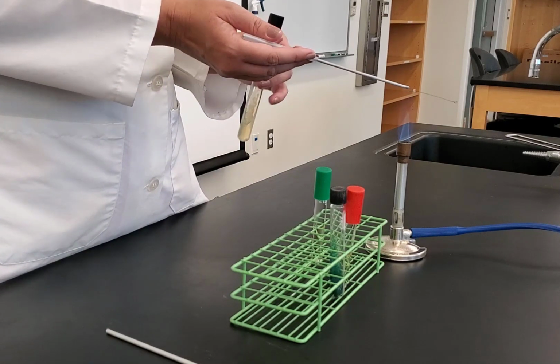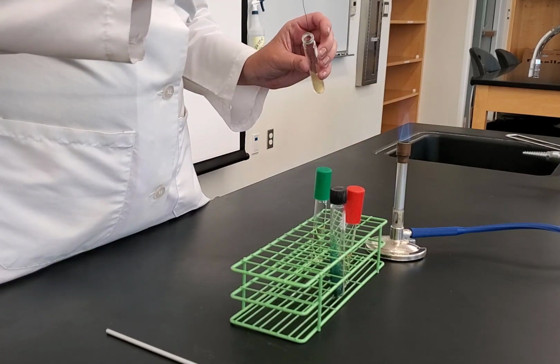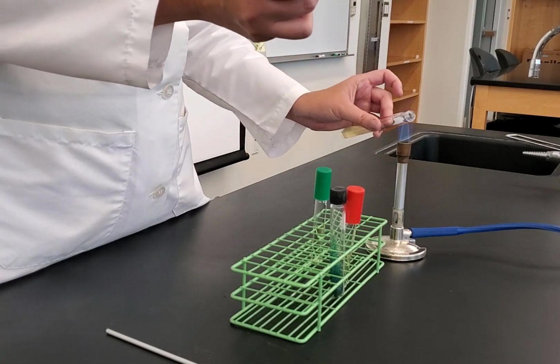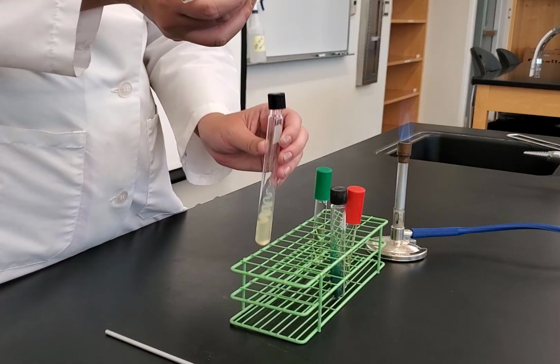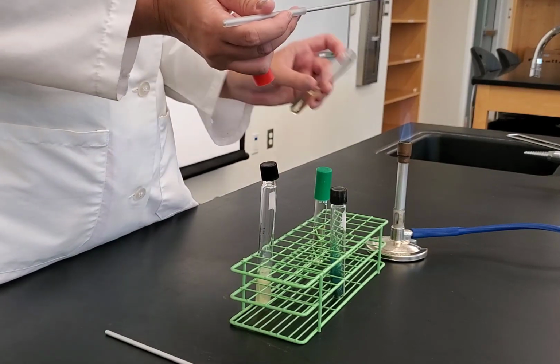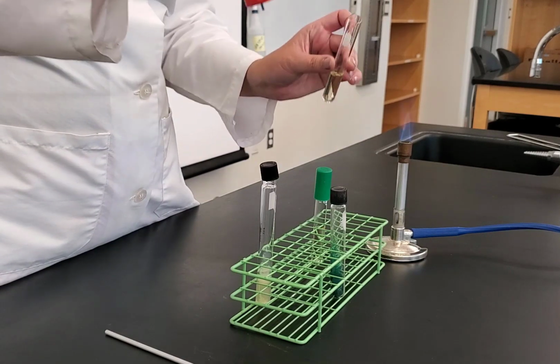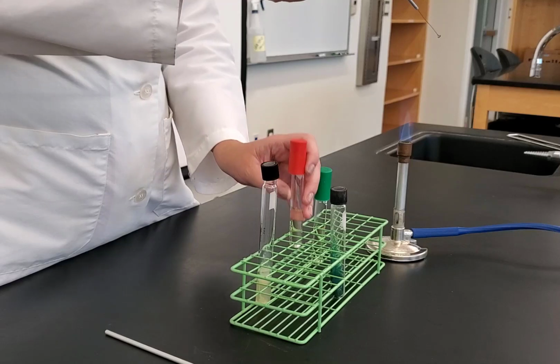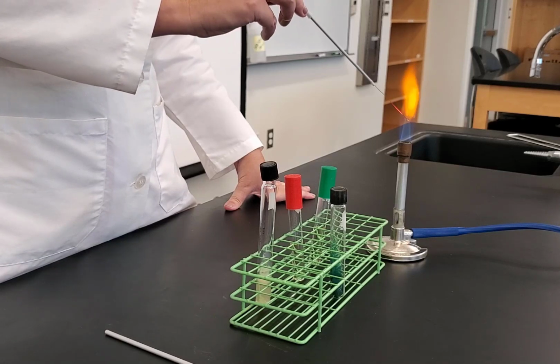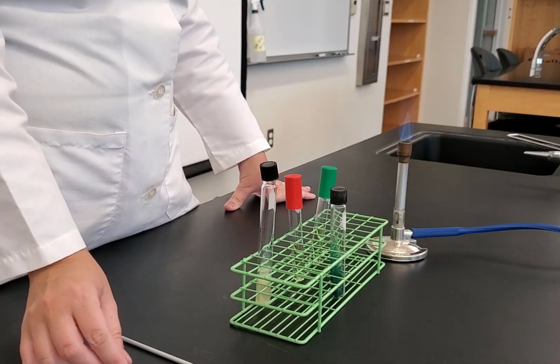So again, pinky ring finger, hold the cap between your hands, your fingers, flame it. Go in, pick up some bacteria, flame it, cap back on. I'm going to inoculate my MRVP broth. So cap comes off, flame it, swirl it in the broth. Come back out, flame, and flame sterilize my loop. And then I can set my loop down. I'm done with my loop.